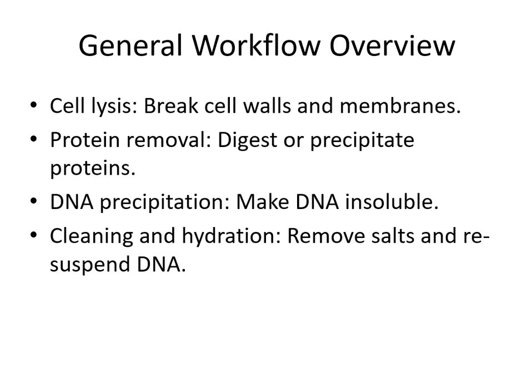For that, we have to do protein removal, and to get DNA in the form of precipitate, DNA needs to be made insoluble. For that, we can do alcohol treatment. Then comes cleaning and hydration of DNA. For that purpose, we have to remove the salts present on the DNA and suspend it in a TE buffer.